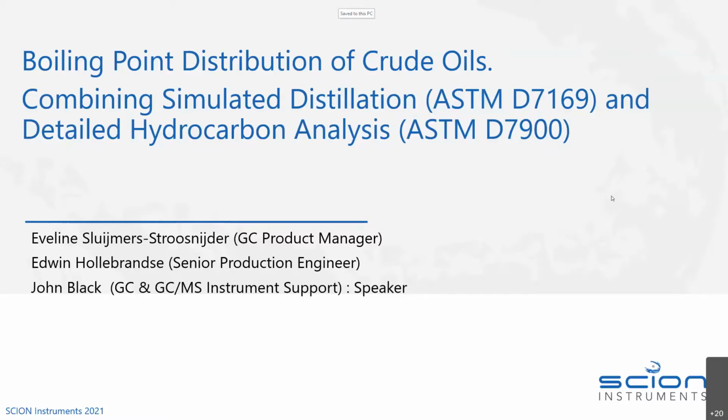Okay, so let's begin. We're going to look at the boiling point distribution of crude oils, and we're looking at gas chromatography method ASTM D7169 for Simdist, and we're going to combine that with a detailed hydrocarbon analysis, ASTM D7900. So we're going to get a combined Simdist from these two GC methods.